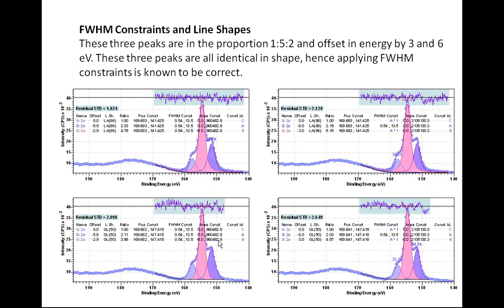The bottom pair are peak models that are using a line shape that is less than optimal for these particular data. And by using less than optimal line shapes, the fit in terms of the residual standard deviation has been achieved by adjusting the limits for the interval over which data are fit. So we can see here we've got two different residual standard deviations, the same interval, the same line shapes, but the difference again is that the full width half maximum is constrained in the one case, whereas it's allowed to vary in the other case.